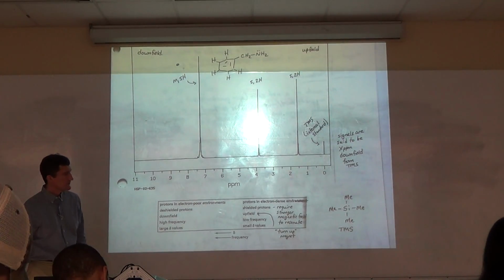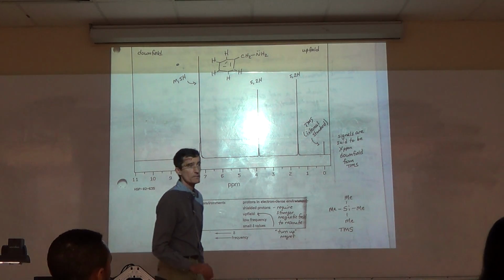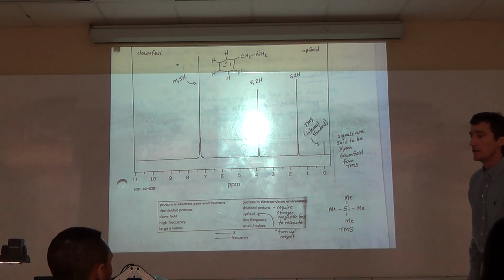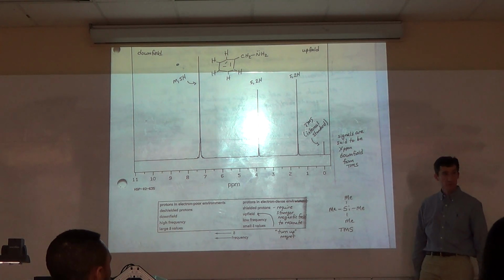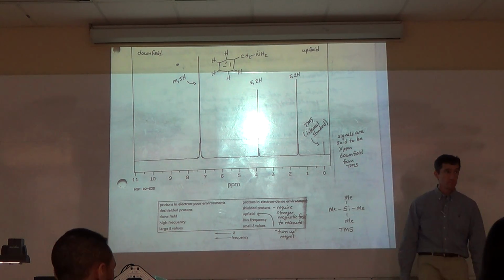That's silicon, and it's known as a silane. What do you think TMS stands for? How many methyls on this silane chain? Yes. Tetramethylsilane is the most common standard. You set that at 0 ppm.